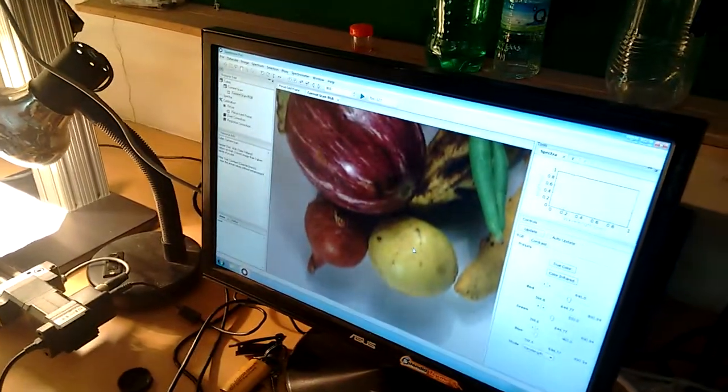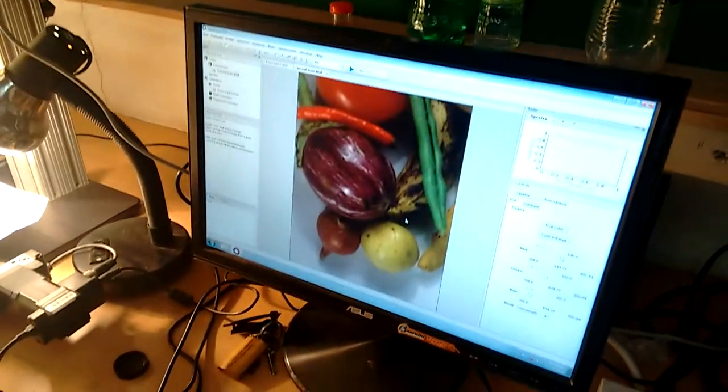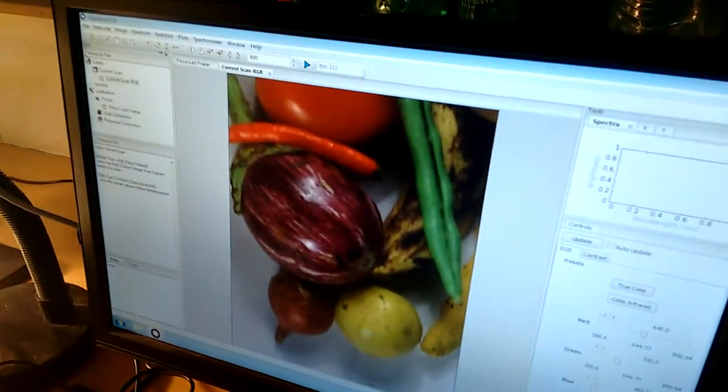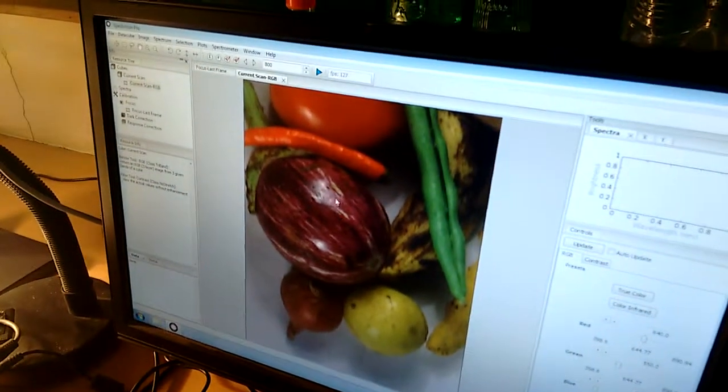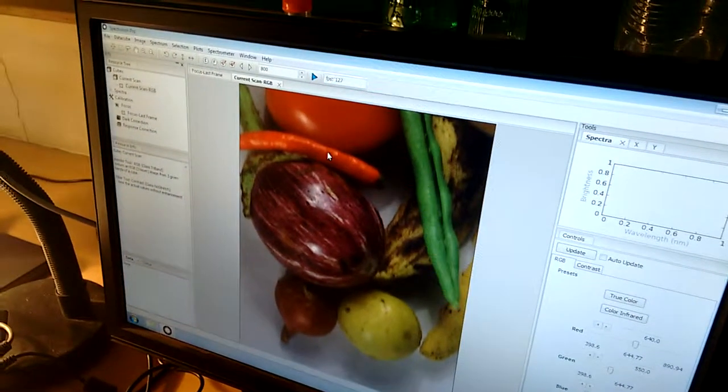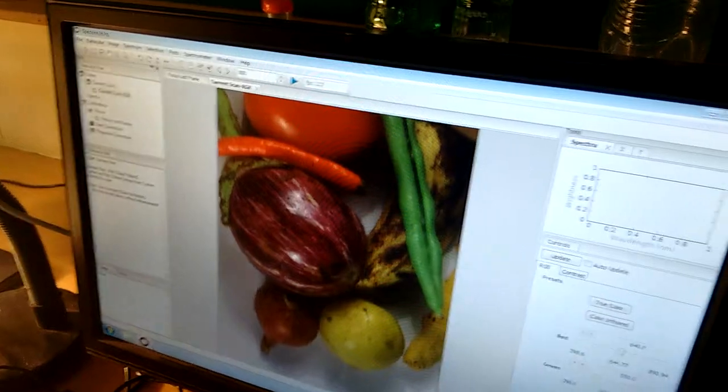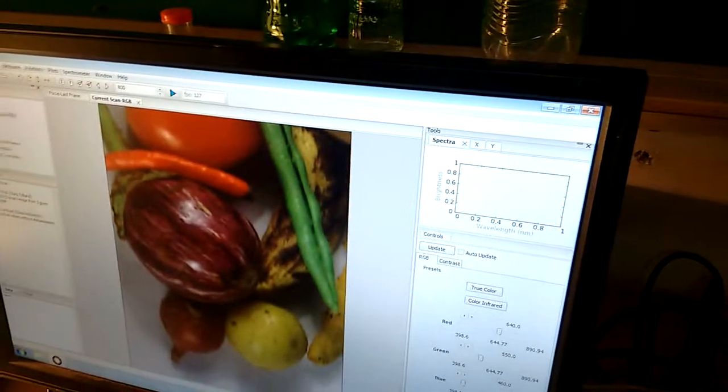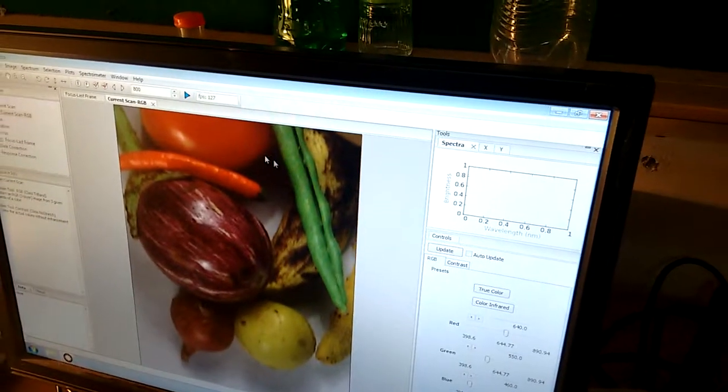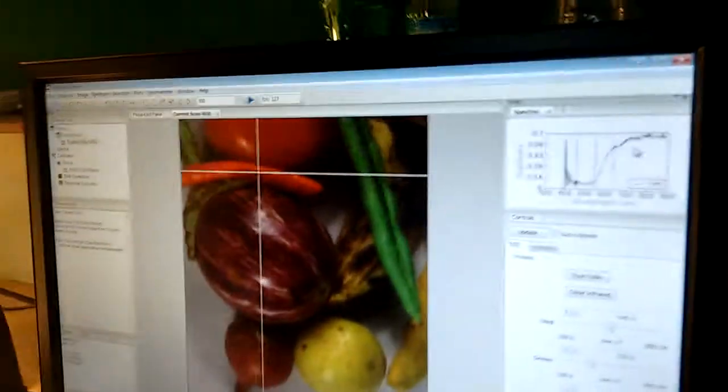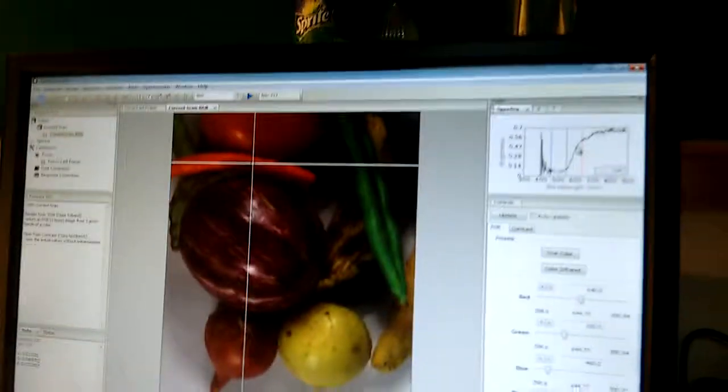So that's all done. The image is ready for analysis. Now if you want the spectrum of this red chili, I will just click on this and click on this. You will see the spectra of the red chili now here.